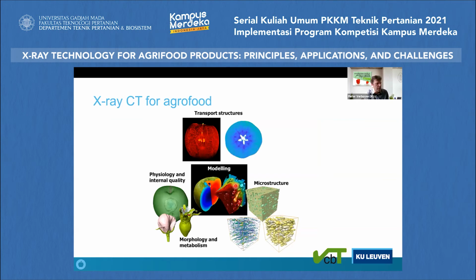More and more, there are a lot of applications possible with this technology, and I will show you some concerning looking at morphology of agri-food products. It could be a very important quality attribute. Where microstructure is important and how we could use it. What are transport structures in agri-food products which are relevant for not only storage but further processing, etc. And how this all is combined through modeling to understand the processes better and to be able to design processes and so on. So in every step here, X-ray technology is important.